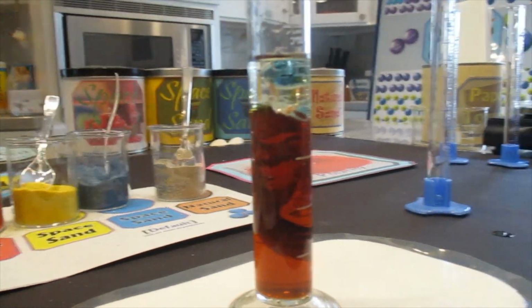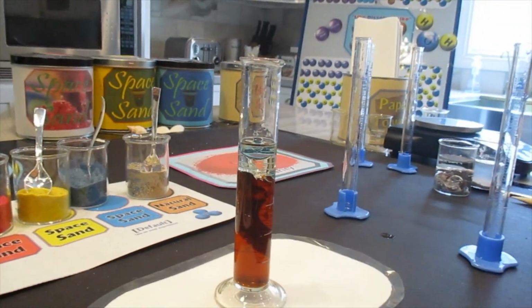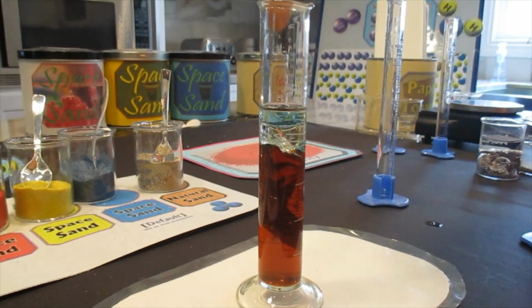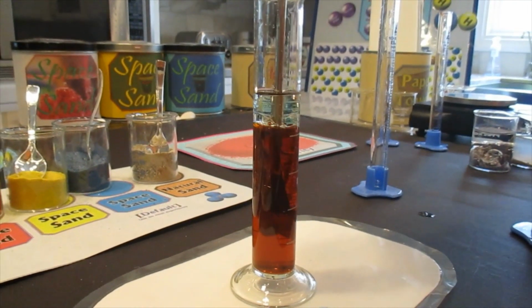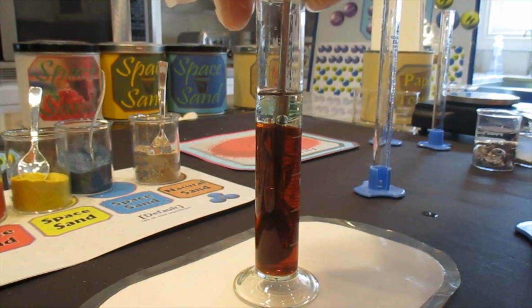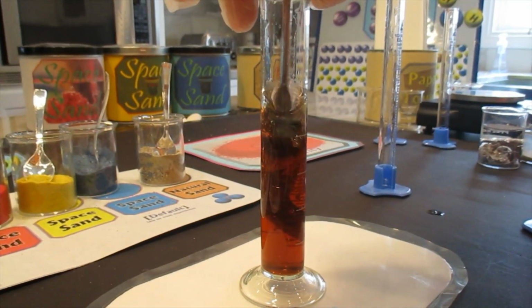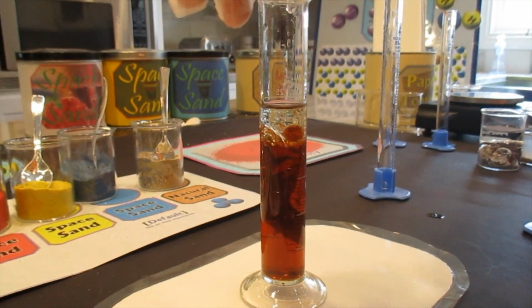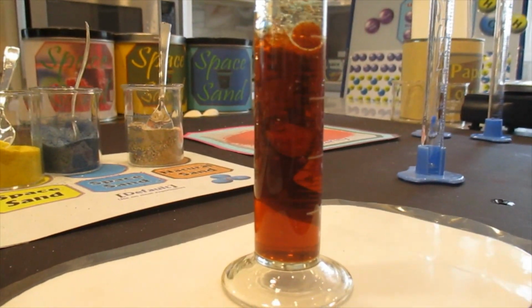So polarity. Now stick your little stirring rod in. Where's the glass stirring rod? Oh, that one's fine. Stick it in and stir. You gotta hold the base, baby, or the top. Okay. Now let's see what happens. And then take it out. Okay, so what happens to the colors?